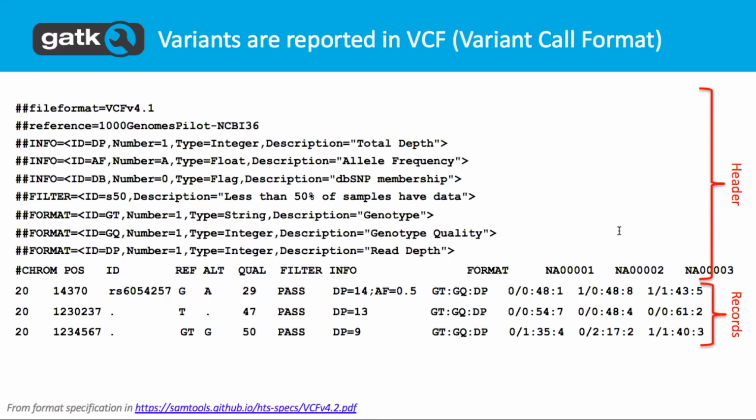How many people are familiar with VCF format? So, most people. Briefly, every VCF has a header and records, and the header has information to describe what fields you have in your records.